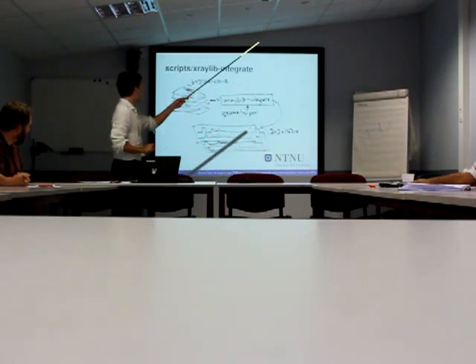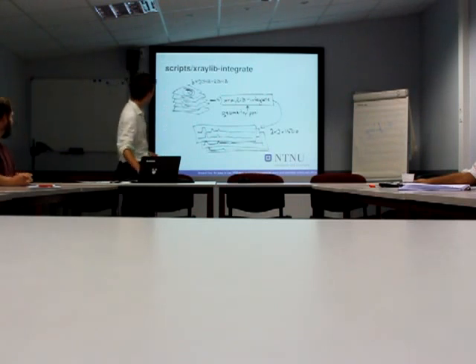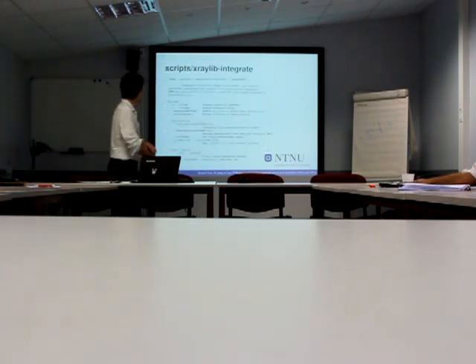So you have some parameter here, temperature for instance, and angle here. And we will try to put it into this for you in the interface. So already this can be useful, because you will see if you have some diffraction and so on.